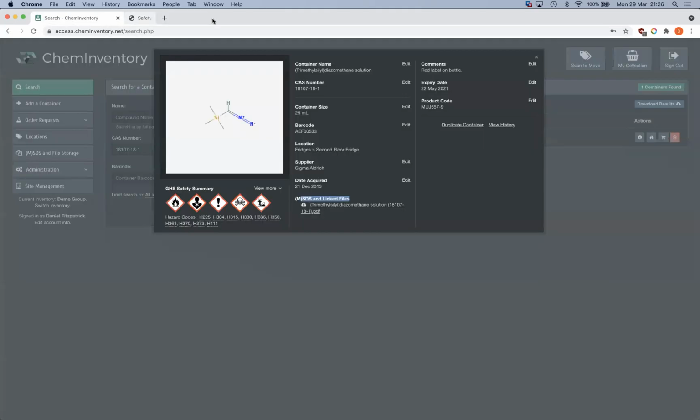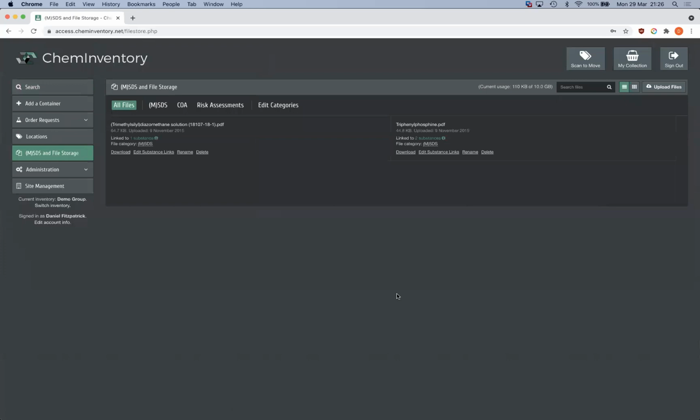So that can be useful to help users have access to the most up-to-date safety information right from search results. At the moment, we don't supply any SDS files from our end. The reason for that is basically suppliers, so chemical manufacturers, retain copyright over their documents, which prevents us from distributing them publicly. We are hoping to get around that later this year by maintaining a database of links directly to supplier websites. So basically we will curate and manage this database of SDS links that when users click on them will take them directly to the supplier website where the SDS file is hosted by the manufacturer.